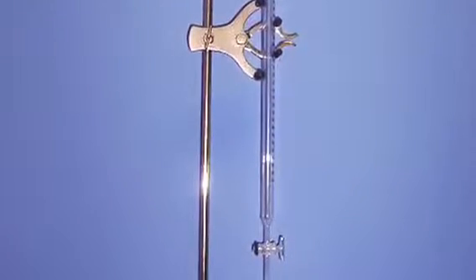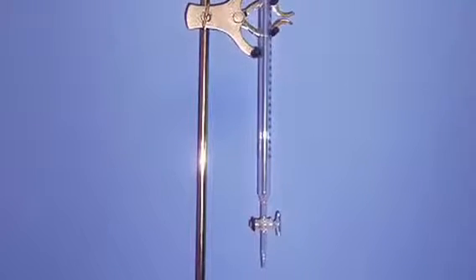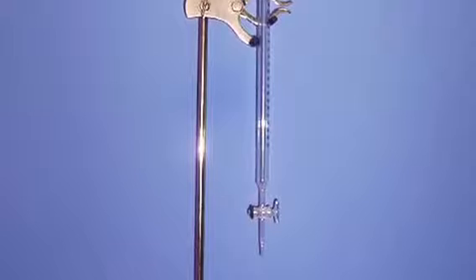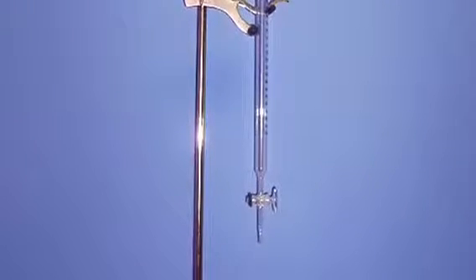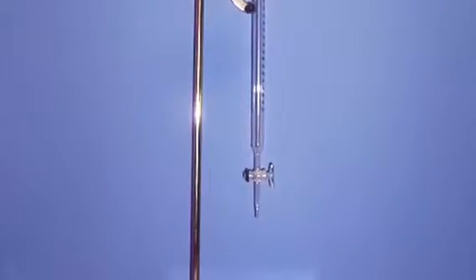Before beginning the experiment, we should start by priming the burette. You should rinse the burette with water 3 times to clean it, and then with the solution sodium hydroxide 3 times to rinse out any water that would give the solution a diluting effect.